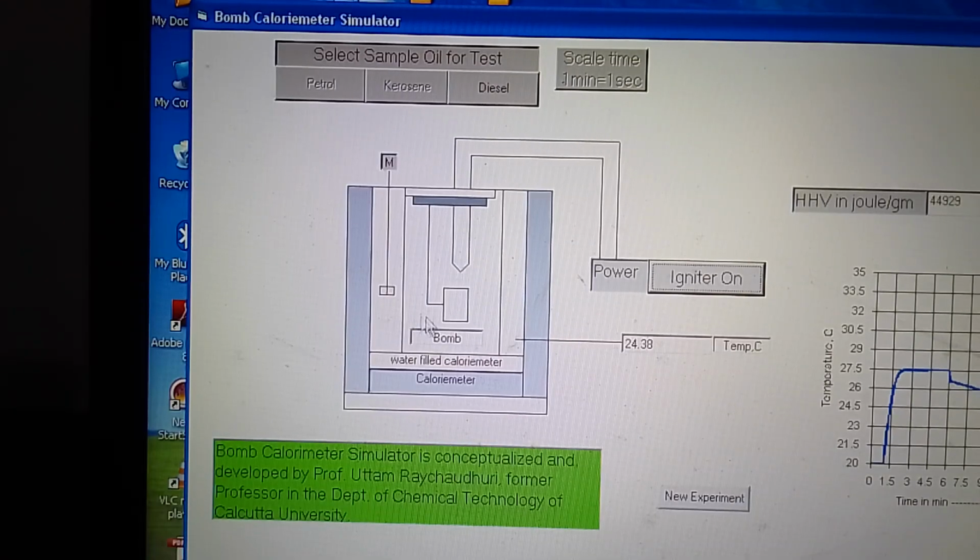The liquid must be clean, and this is properly placed in an insulated vessel, and the top also will be covered with an insulated cover that is not shown here, so that no heat is lost to the surroundings. And before you place this igniter, you have to connect a cellulose wire or rope, which will burn to aid the combustion, without which it is impossible to do it.